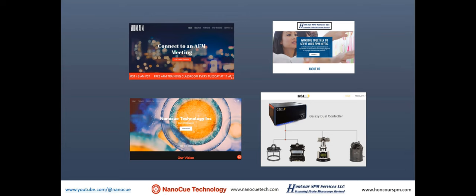I just presented this time a lot of these in-situ chemical reactions. You can observe in-situ using atomic force microscope. And then in-situ study is not an easy task. There's a lot of things involved. But if you can observe something happening in real time, that's very interesting and a lot of fun to do.